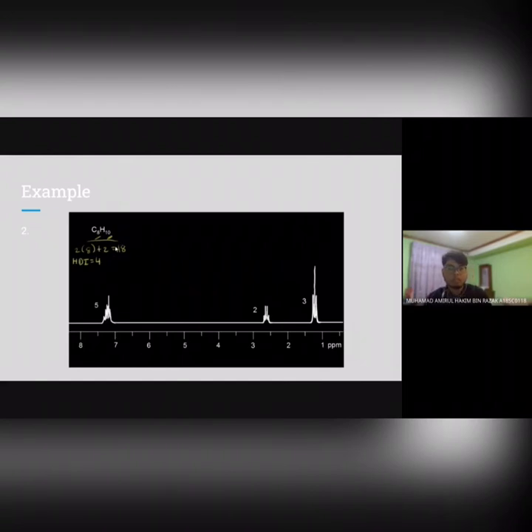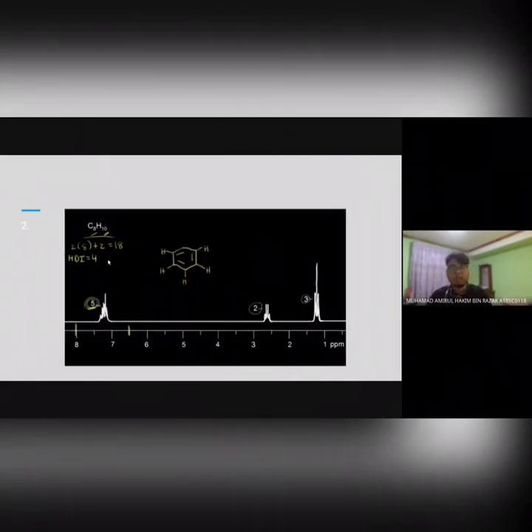Okay. So HDI, setiap nombor HDI memberi maksud yang lain. Maksud yang berbeza-beza. So apa yang kita perlu tahu untuk HDI 4, HDI sama dengan 4, molekul itu terdiri daripada benzene ring ataupun aromatik. Okay, itu yang kita perlu tahu. So untuk contoh C8H10, kita tahu bahawa bentuk molekular formula ni adalah benzene ataupun aromatik. So kita terus go through setiap peak dan kita akan go through peak yang pertama dulu, peak yang sebelah kiri.